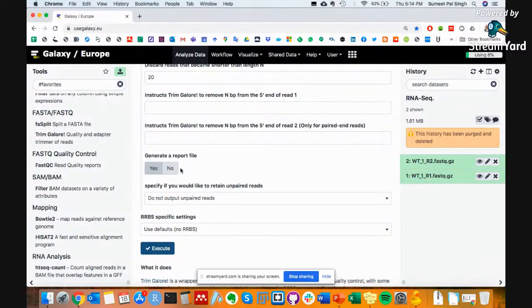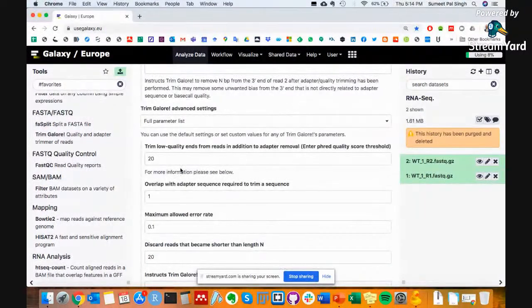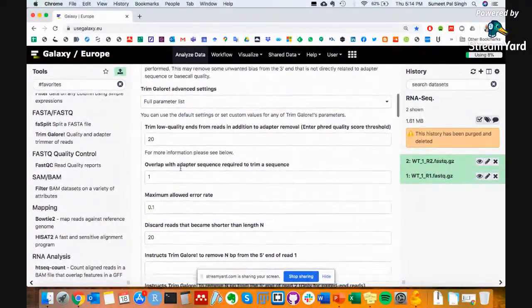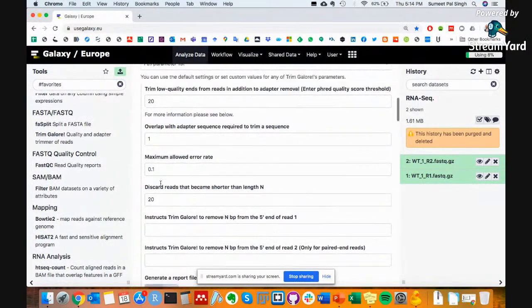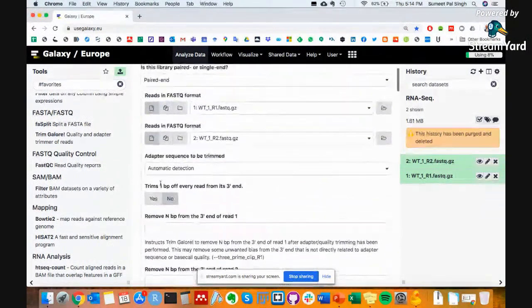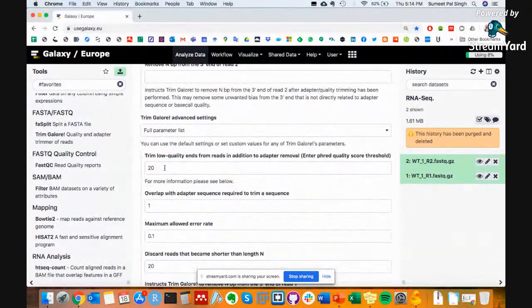how many sequences were trimmed, how many sequences passed the quality control, because Trim Galore also does quality control in two different ways. So the first quality control is that if the read quality, or the base pair quality, is less than 20, then it is removed, right?